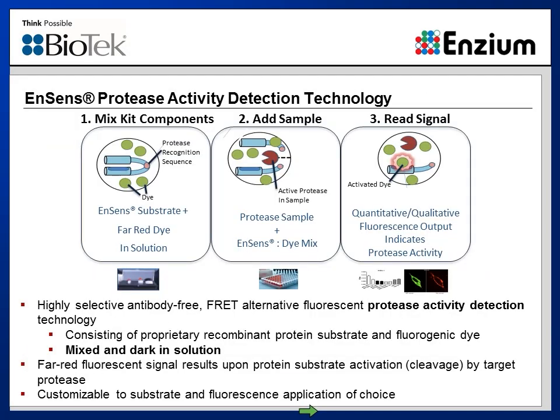Moving on from the initial invasion analysis, we also performed 2 different types of mechanism of action studies, as not only is it critical to examine the phenotypic invasive properties of cells and the interruption of that invasion, but it's also important to evaluate the different enzymes and binding activities that could potentially be involved in the invasion process. In the first that we're showing here, we monitored the activity of matrix metalloproteinases, or MMPs, that have been shown to play a role in the tumor invasion process.